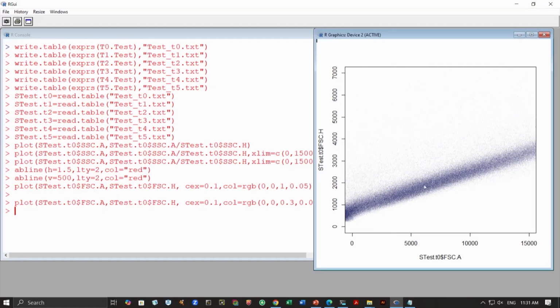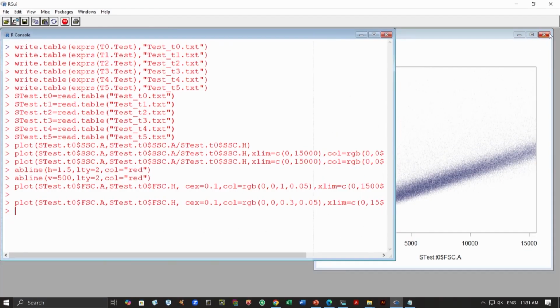If it is not clear, we can actually make a contour plot, or a density plot, where you see the cell density, and this will tell you that most of the cells are here, and this is actually noise. So we have looked into preliminary filtering.